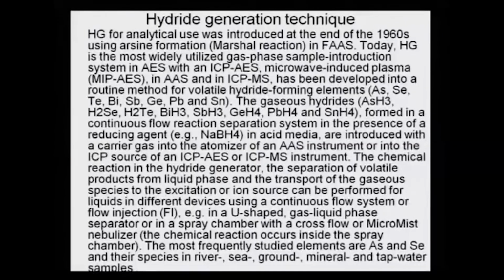We had talked about hydride generation fleetingly. Here is a little more detailed account of hydride generation. Hydride generation is applicable both in atomic absorption as well as in ICPs. Hydride generation for analytical use was introduced at the end of the 1960s using arsine formation, that is the Marsh reaction, in flame atomic absorption spectroscopy.